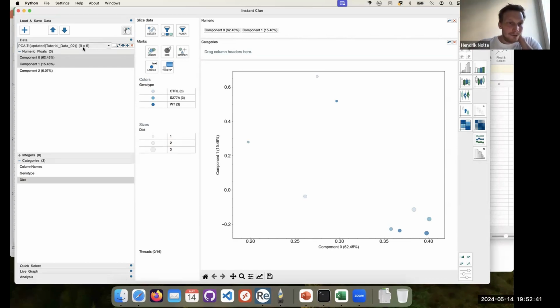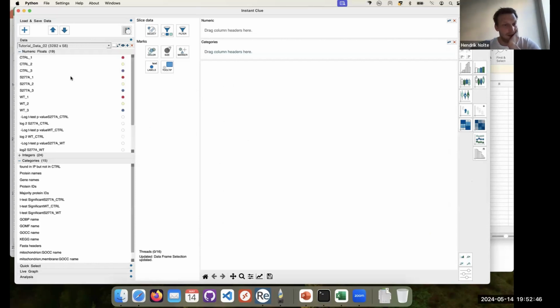Okay, then as the last thing, what is really common to use now is the so-called UMAP, and we are also using that a lot. The workflow that we are utilizing is based on, again, selecting the significant ones and then calculating the UMAP. The UMAP is also a way that tries to reduce the number of dimensions and visualizes everything in a 2D plot.